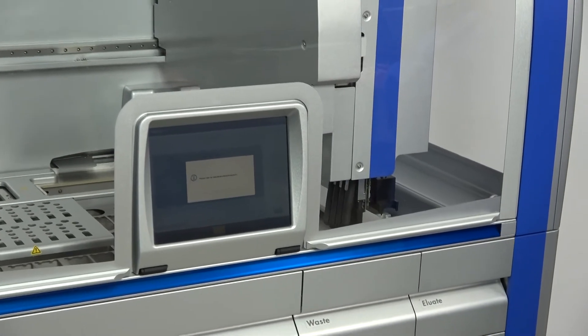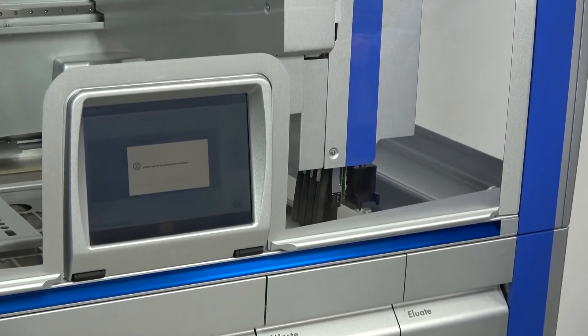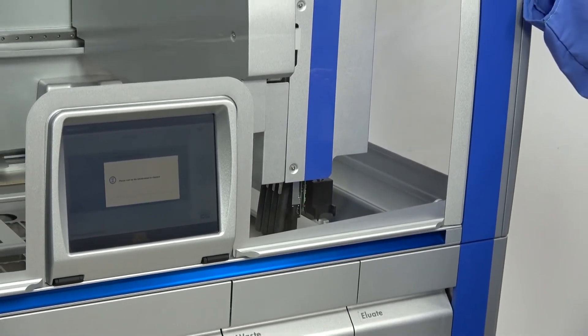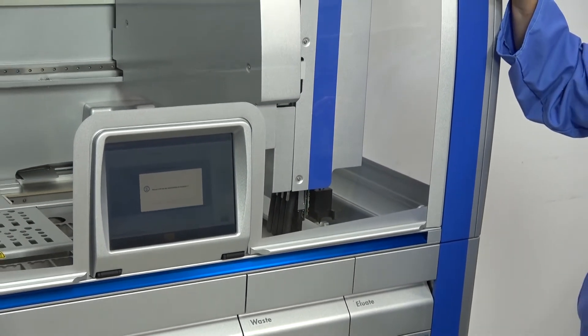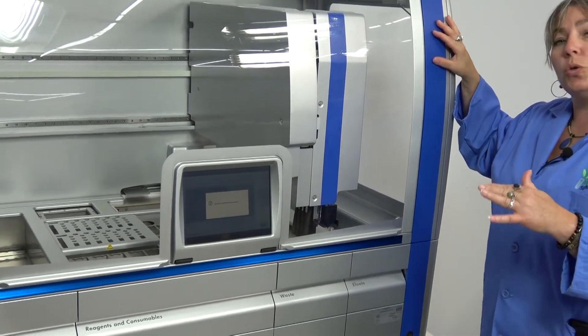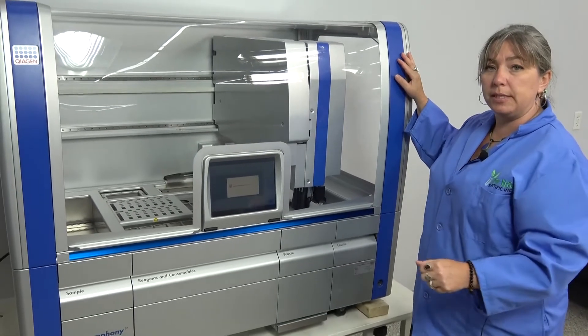Automated sample transfer, heated lysis, washing, and elution are all features of this instrument. It processes samples up to one milliliter, and it can accommodate a variety of tube sizes, so you can use what you already are using in the rest of your facility.